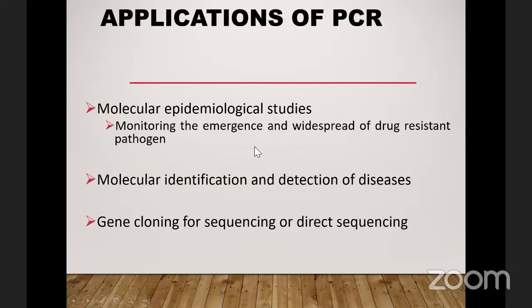So this is considering applications of PCR. We have actually talked about several areas we can apply it on, like in research, disease diagnosis, infectious disease diagnosis, in agriculture, and several other downstream applications. You know, we talked about mutation-specific PCR. You can detect several mutations with PCR. You can detect infectious disease. You can help in disease monitoring. A patient that has been diagnosed, you can help to check if there is improvement.